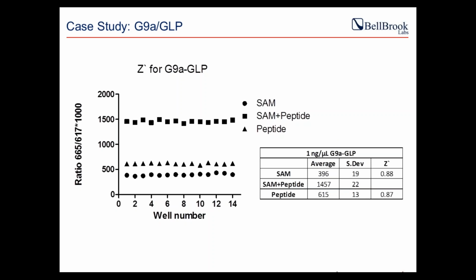It's about 1.5% for the positive controls and less than 5% for both the negative controls. These statistics reflect the stability of our reagents, because if there was any degradation of the RNA aptamer, we would see that immediately with the signal variability. And if there was SAH in any of these controls, the assay window will start dropping over time, so you would identify that right away.